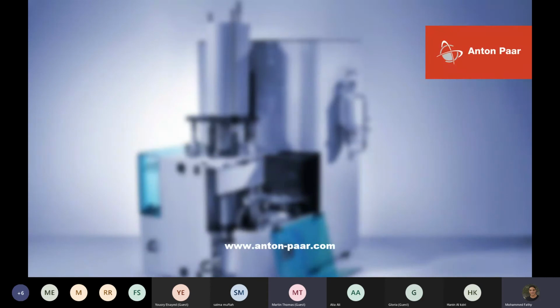Now it's completely safe to leave until you're ready to put it into the high pressure. Let's say the previous high pressure hasn't finished. You can just set it aside. It's perfectly safe. And when the high pressure is finished, the system will come back to atmospheric pressure. You open up the high pressure cavity. You take the old sample out.